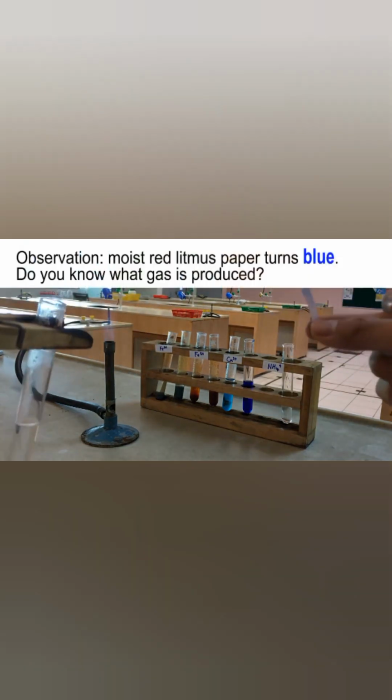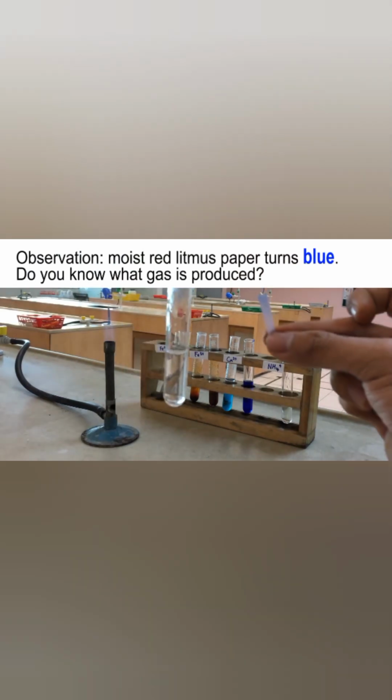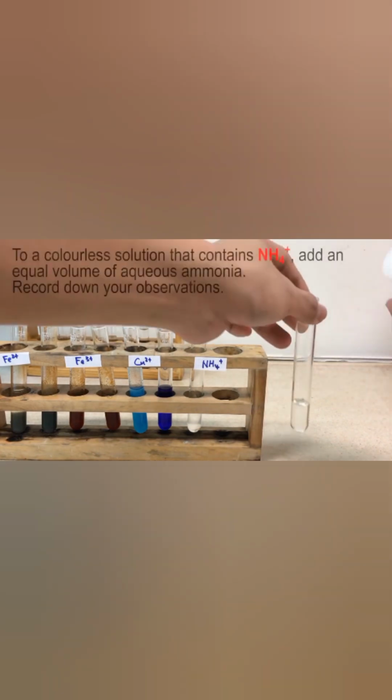Okay. Now you see that the moist red litmus paper turns blue. Do you know what gas is produced? Let me know the name of the gas that is produced.